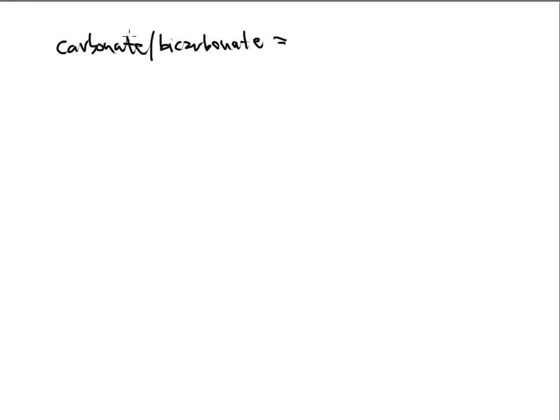instrument. The bicarbonate-carbonate, because these do have ions, they do generate a little bit of signal. No matter what you do with them, they're going to generate a little bit of signal. And that means a little bit of conductivity is going to show up on your software and your instrument. So you will never see a zero conductivity because of it.